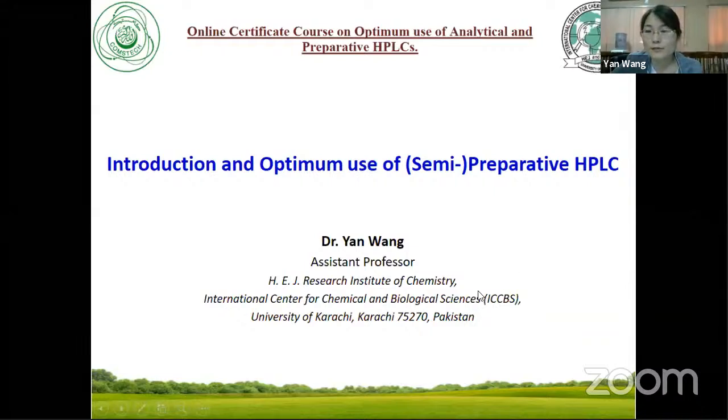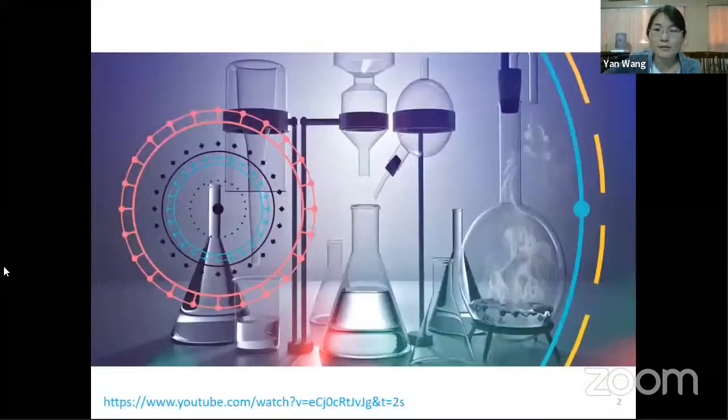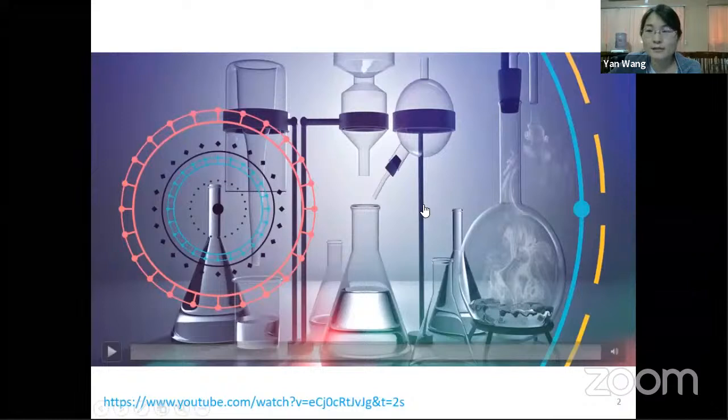So until now, we have learned a lot about analytical HPLC. Before we start preparative HPLC, we can think about one question. What's the difference between analytical and preparative HPLC? Here I have a video.